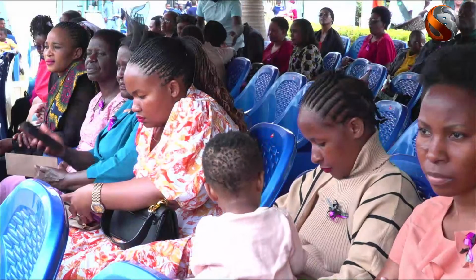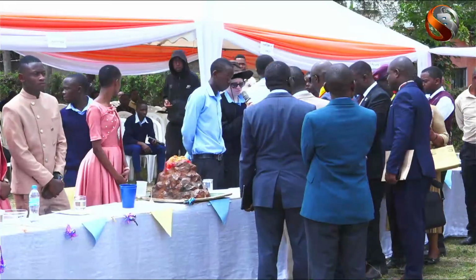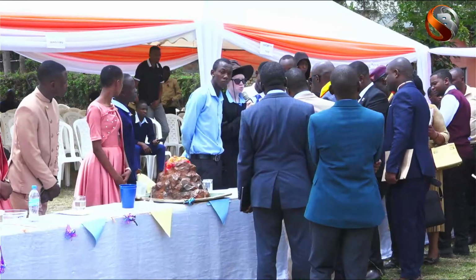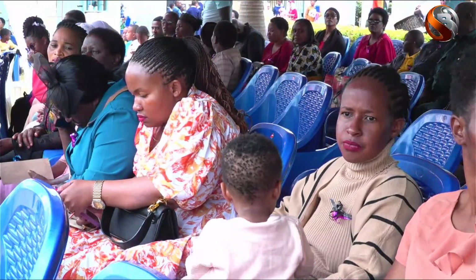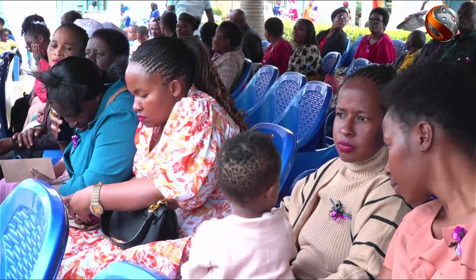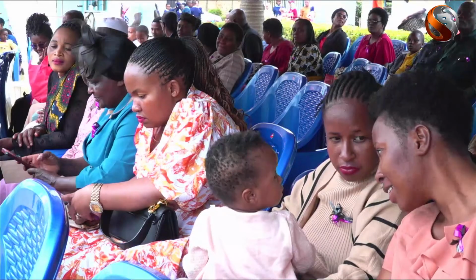The liver converts harmful substances into harmless substances within our body. We are going to use a fresh liver and alcohol. The aim of this experiment is to show how alcohol drinking and other harmful substance taking affect our livers and reduce efficiency in our bodies. Now we are going to cut a small piece of a fresh liver and add alcohol to it and observe the changes.